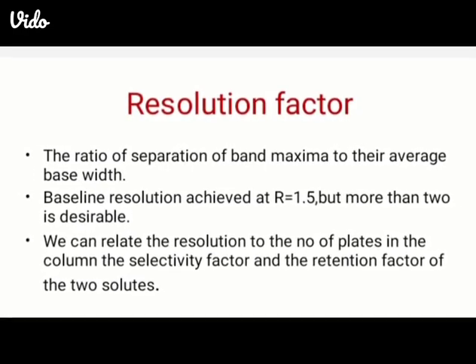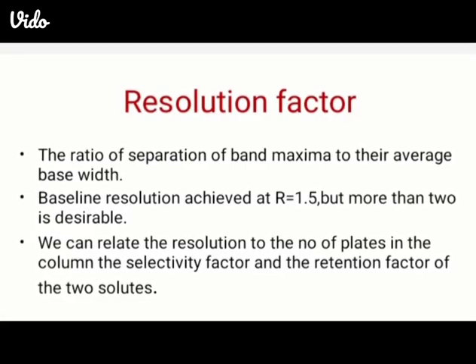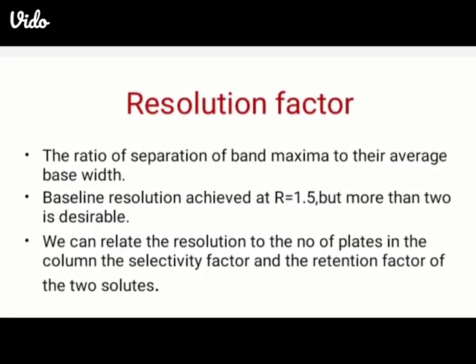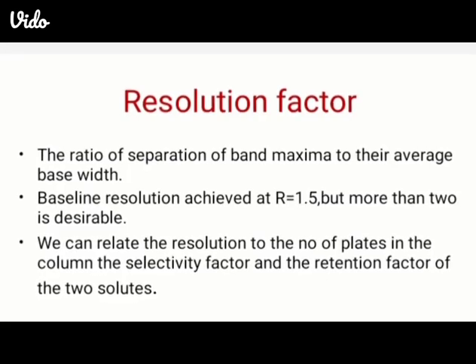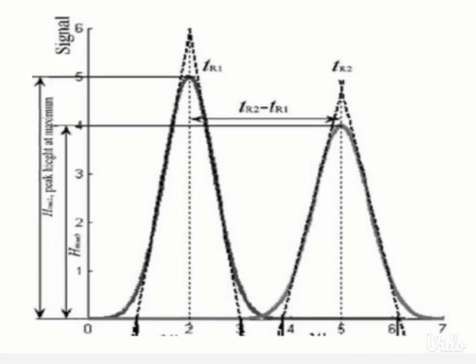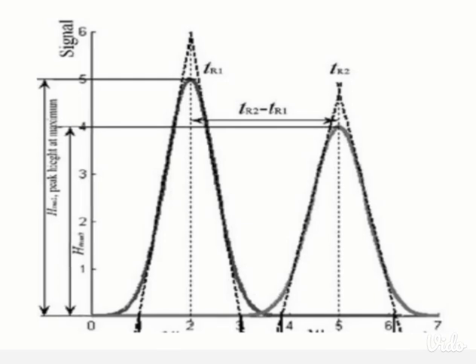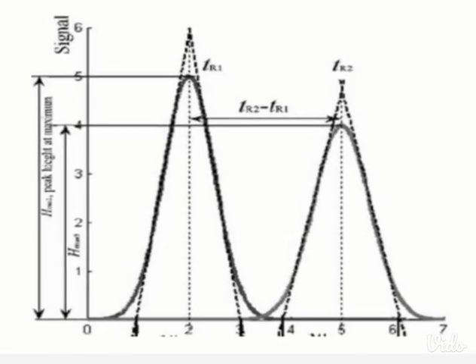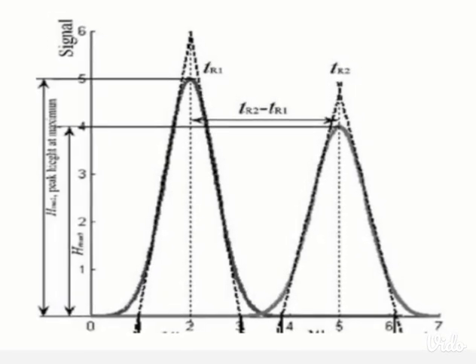The next factor is the signal to noise ratio. The noise is not the response of our analyte or solute; it is a response of the solvent, an unnecessary response from the detector. The short-term noise influences the precision of quantification. So the signal to noise ratio is a useful system suitability parameter to identify the noise effect on the quantification of impurities. Basically, the impurities are interpreted by using this signal to noise ratio.